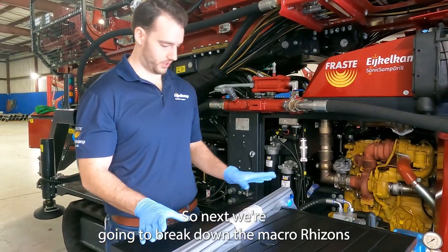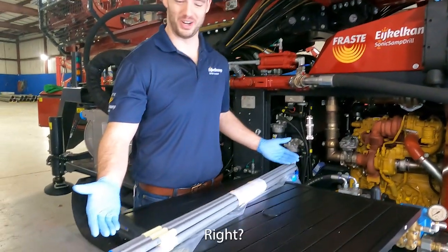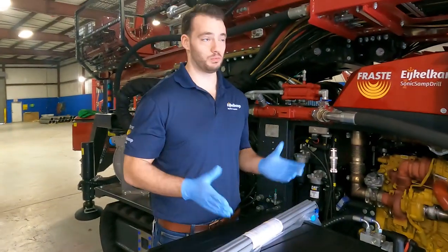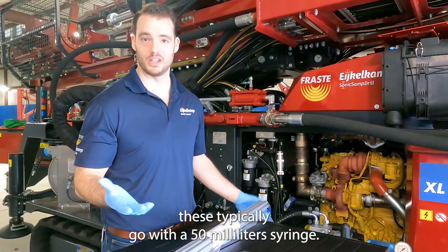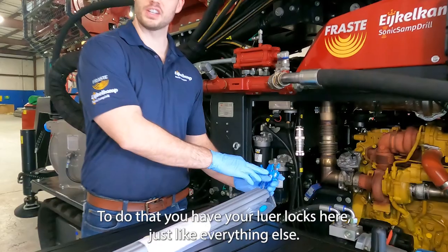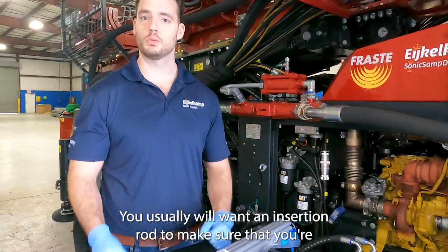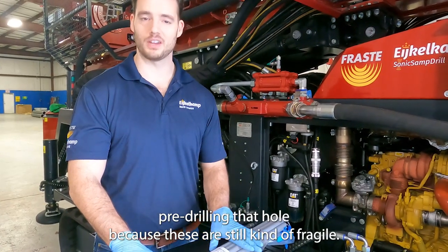Next we're going to break down the macro rhizons and see why they're called macro — they're very large. This one is actually 90 centimeters in length. Macro rhizons are ideal for field applications and when you need a larger volume of water. They typically go with a 50 milliliter syringe, and just like the others they have luer locks. You'll usually want an insertion rod to pre-drill the hole because these are still somewhat fragile and you want to make sure you can get them into the subsurface.